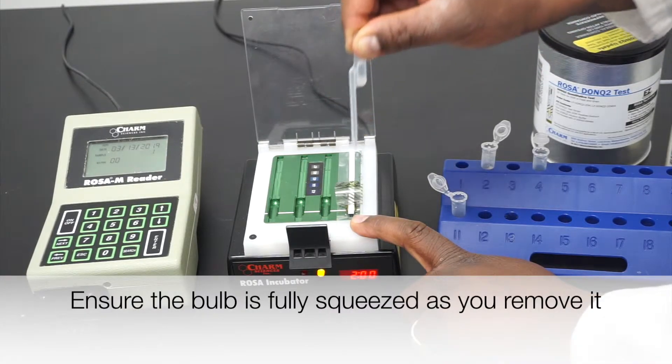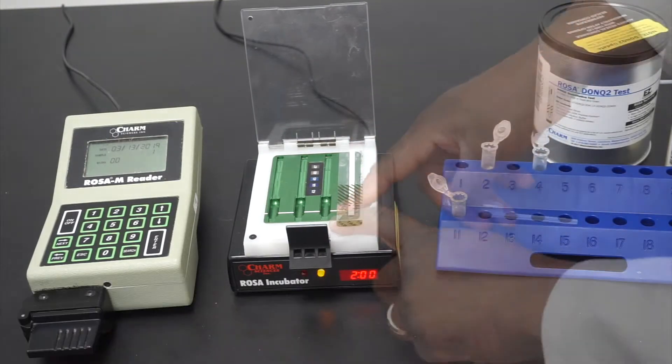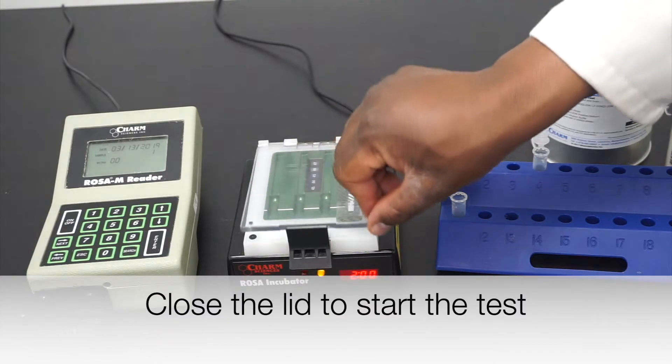Maintain the bulb fully squeezed as you withdraw the pipette from the test strip and reseal the test strip. Close the incubator lid to start incubation.